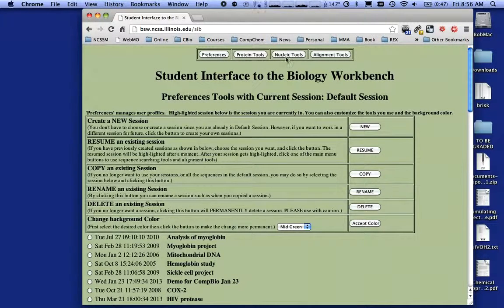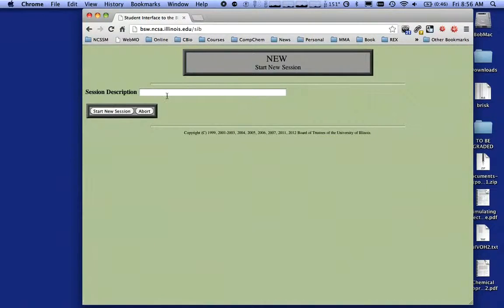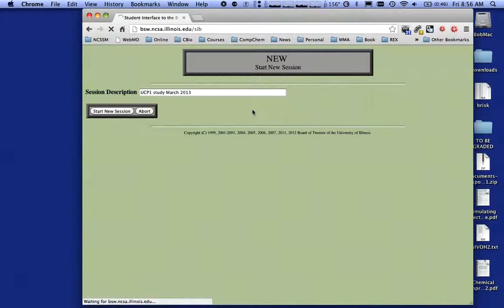Notice there's also a protein tools, a nucleic tools if you're working with base pairs such as A, C, T, and G, and an alignment tools. By default it puts you into a default session. I'm going to do a study on a protein called UCP1. So I'm going to click on New and when it gets to the window, I'm going to call this 'UCP1 study' and put in March 2013, and then start the new session.